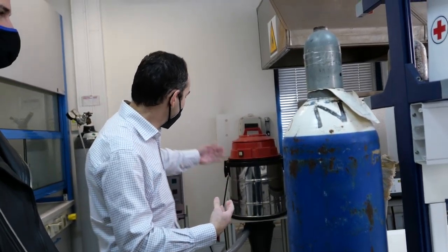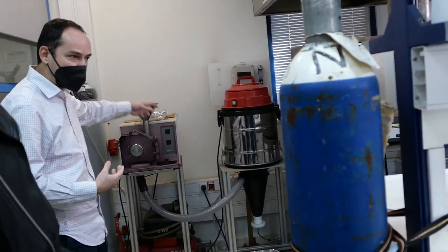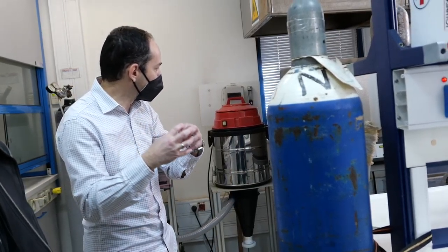Typically once we have a waste, we have to perform a lot of analysis. First we need to mill the waste, we use a mill to make this into a powder.